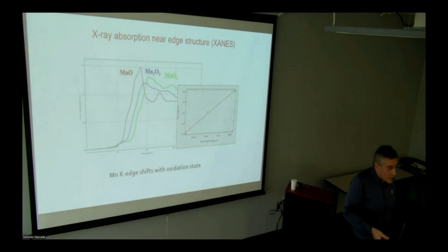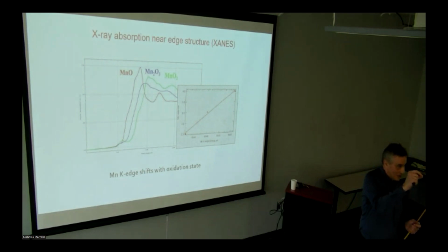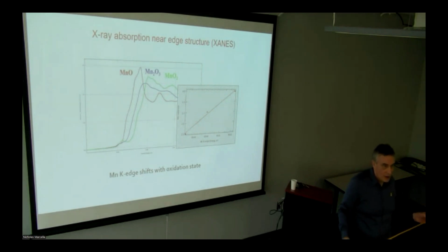So I just explained the principles that can be used to study the oxidation state of materials, for catalysts also. If it's some kind of oxide catalyst, it's more or less trivial. For a metal catalyst, it becomes somewhat tricky because the electronic density may play tricks. On one hand, if you reduce your catalyst, it has more electrons, lowering the effective potential. But on the other hand, it raises the Fermi level. So it's kind of like increasing the level. Which one wins? I'm still not sure. So this is really a moot subject that is still overlooked, with many opportunities for research.